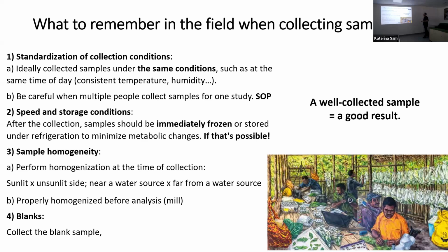And last are the blanks. Blanks mean samples without your sample. Typically, it's empty plastic bags.